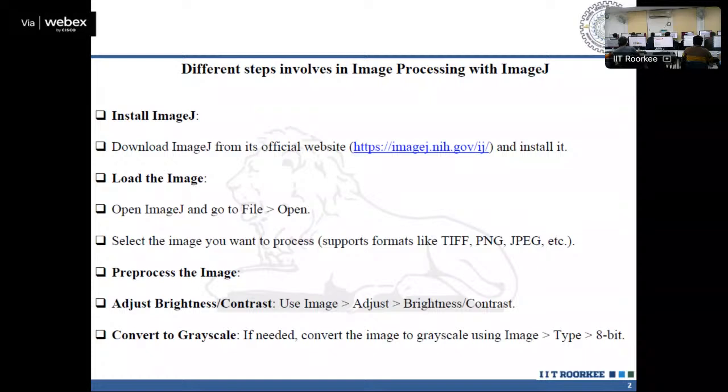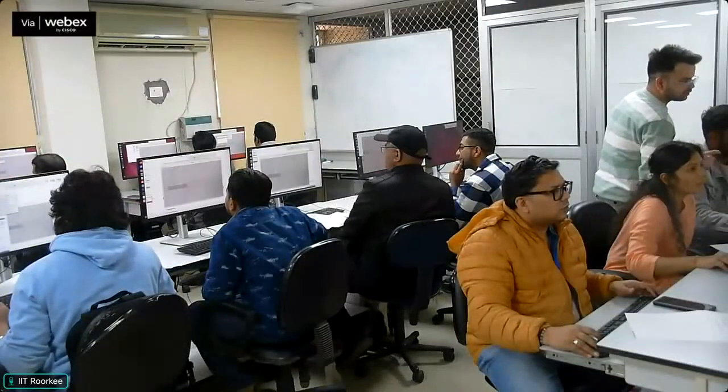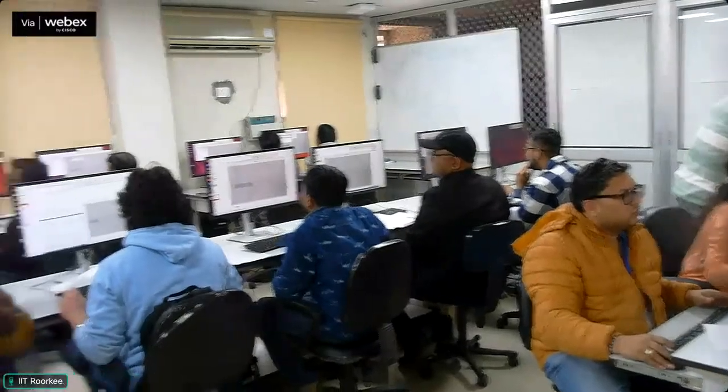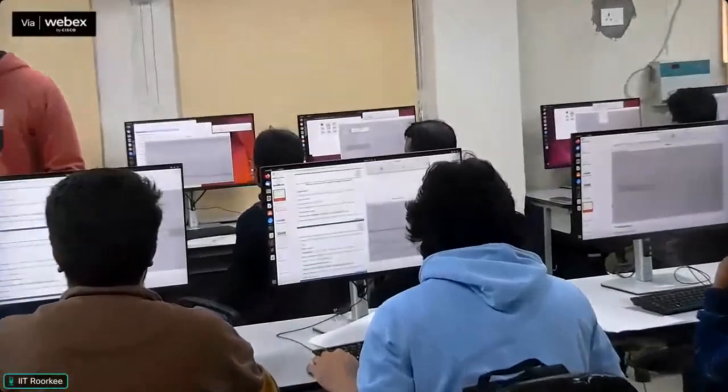This is the known distance, 7 mm. So initially give the distance 7 mm. So that is the tube capillary of 2 mm. We don't know the exact inner diameter of the capillary. So first we have to give the initial distance, and we know the outer diameter of the tube, that is 7 mm.